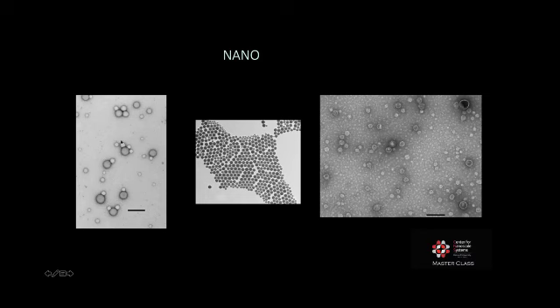Some other examples of nanoparticles on this slide. If you were to take a reading of this from an optical density instrument, you might get a different answer than what you're going to get looking at the images directly. So you're QCing nanoparticles again in this way.